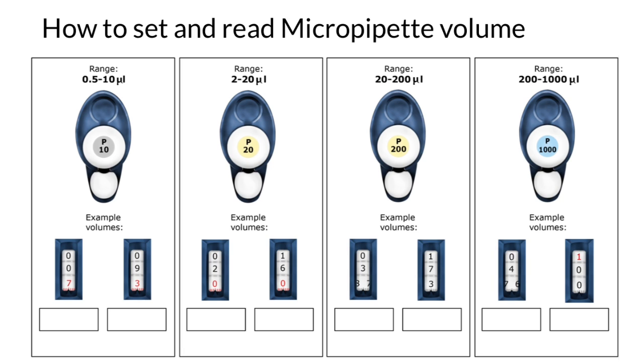First of all, you cannot use just one micropipette to take any volume you like. As you see, we have different micropipettes and P here stands for pipette. And the number below stands for the maximum volume we can work with this micropipette.